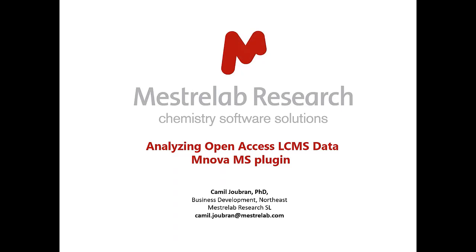So today, my focus will be on the MS plugin and really focus on what I call open access LCMS data. And what I mean by that is the focus here will be more on the UV section, because reaction monitoring, purity of products that are made, the focus is UV, with secondarily looking at the mass spec. So that's the reason for the title.